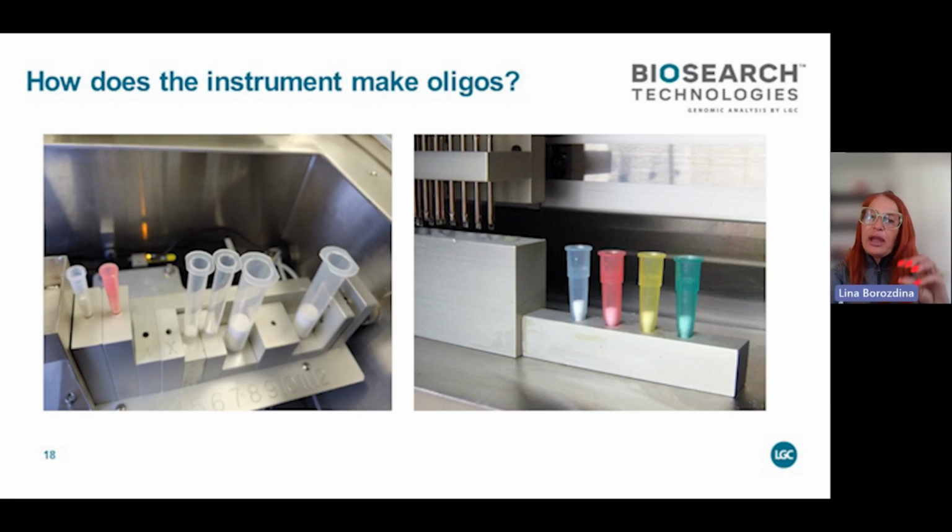The coupling step and all the reaction steps, except the wash, do have wait times. The reason is so the reagent actually has time to penetrate those little grooves and time to react. If you just put it in there and flush it, you will never have an oligo. So the instrument programming allows you to set the specific time of contact inside the column. And also you put a lot of solvent in there, and it's slowly moving through, exposing the CPG to fresh reagent.